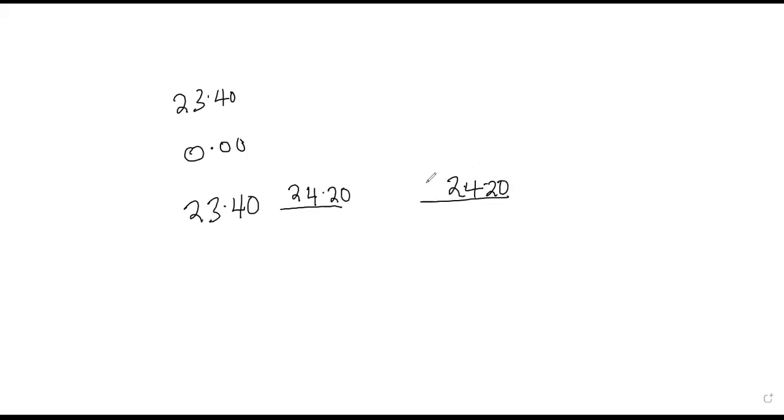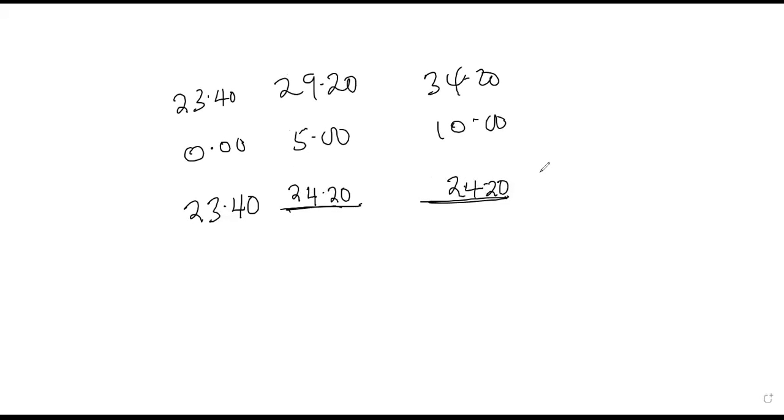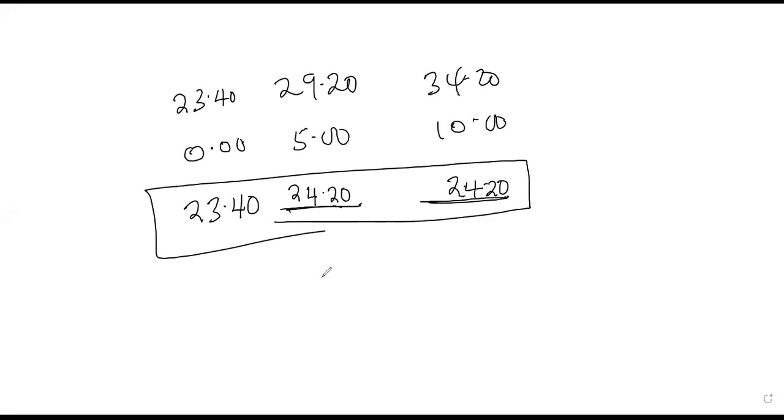24.20, something like this. Then here maybe I can make my starting point, remember I'm interested in these values. So meaning here I can say maybe 5.00, 10.00. Then I add to get this. But that one, nobody should know about what you've done. That is your skill maybe that makes you pass the score. But it may not render that you are practically accurate. The average may be cancelled.